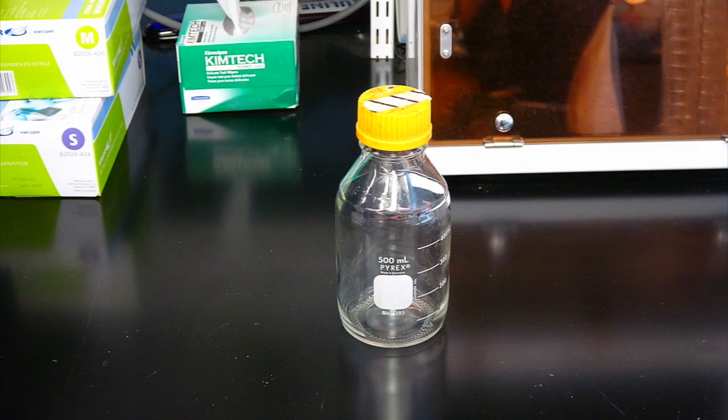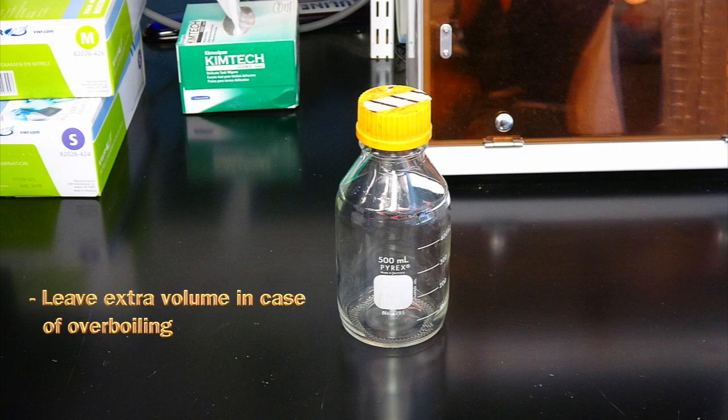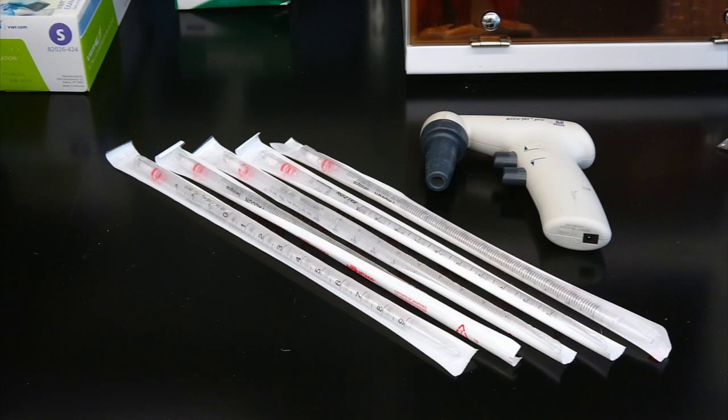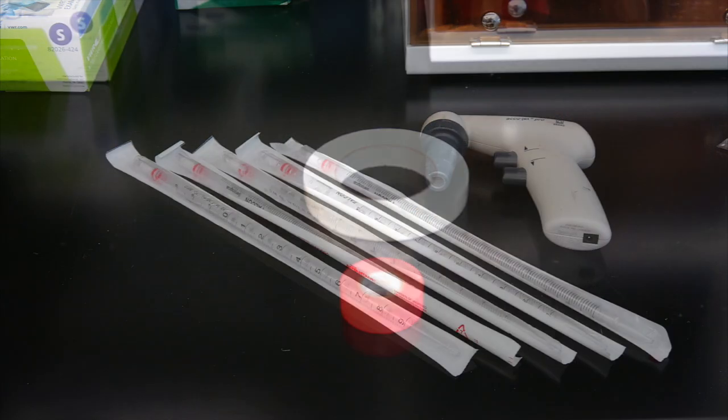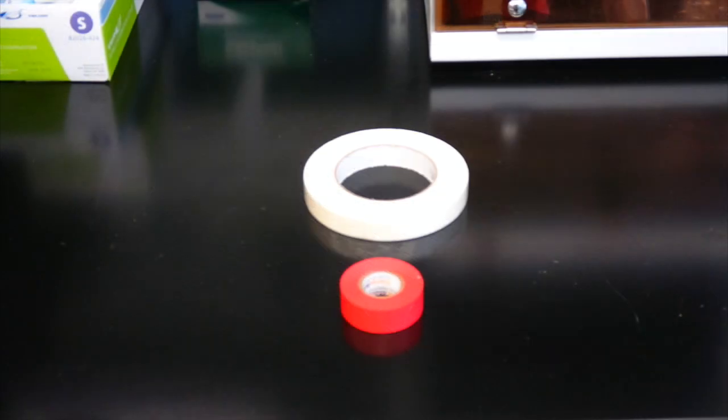Next comes our glassware and disposables. We will make the 220 ml of molten LB agar in a 500 ml bottle. Your bottle should always have plenty of extra volume so your LB agar doesn't boil over in the autoclave. We will use the sterile pipettes to aliquot the gel mix. Finally, we'll use the autoclave tape to label our bottle.